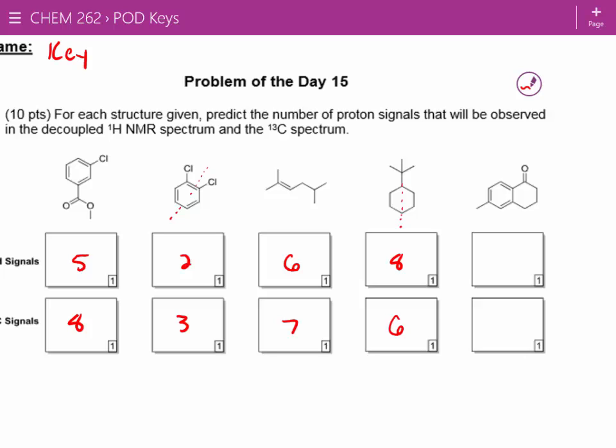You think counting's hard until you have to do it, and then you're like, oh, wait. Did I say 5? Did I say 4? I'm getting really confused now. So if you need to, do the tally system or label them as protons A, B, C, D. I used to be like Megan, just saying approximately. Scientists don't like to use the word approximate when it comes to spectroscopy, I guess. A ballpark of a dozen or so, you know.